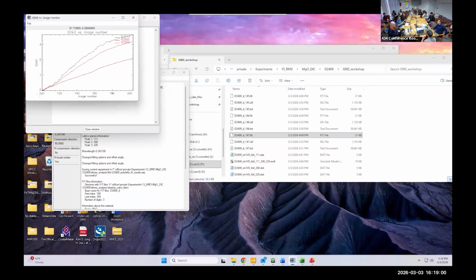Yeah, this is what Pam says. It will be different. Yeah. So you see all three lines gave a slightly different answer for the stress. And it's actually like this one's 2 versus 3.5. So it's quite a big difference.